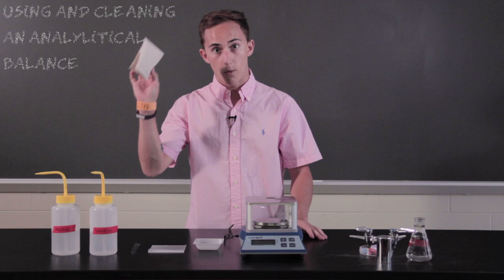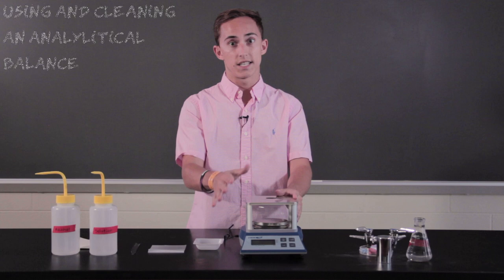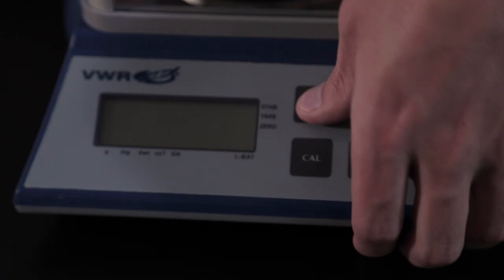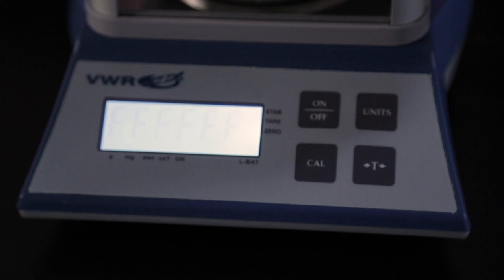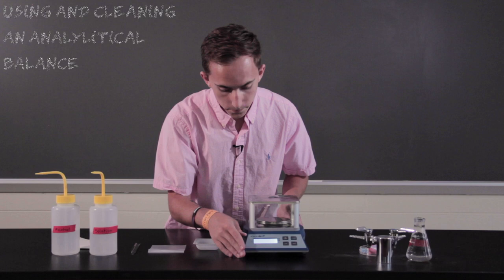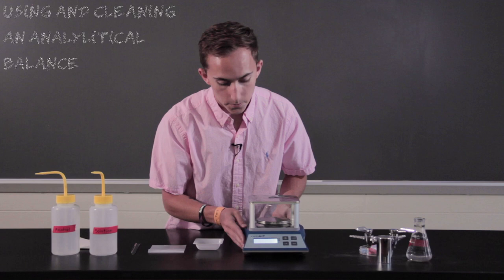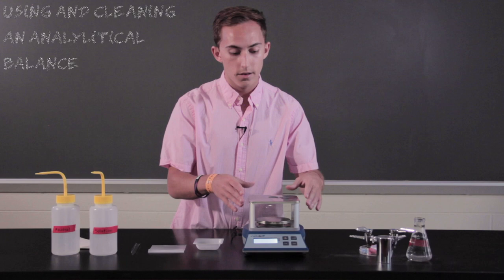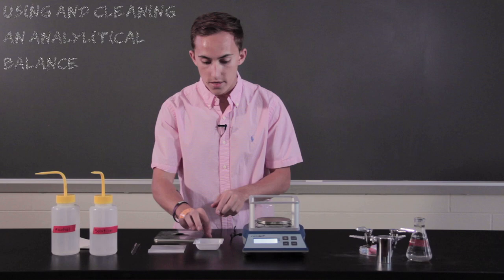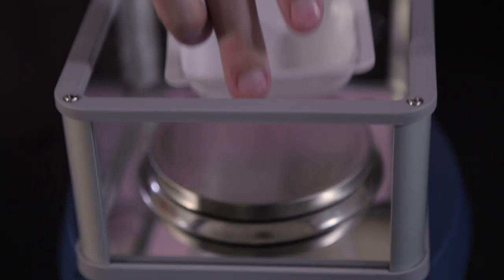First thing we're going to learn is how to balance a sample on an analytical balance. You're first going to turn it on, you're going to let it do its thing for just a second. It's just counting down. Perfect. Then, you're going to take the top off and set it aside, and then you're going to put your weigh boat on top of it.